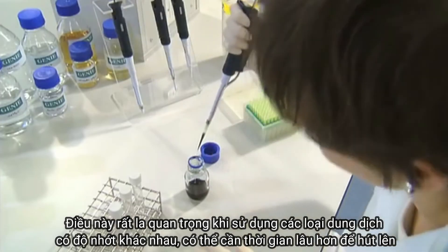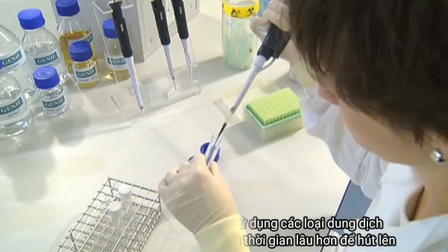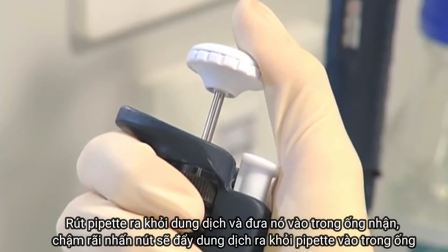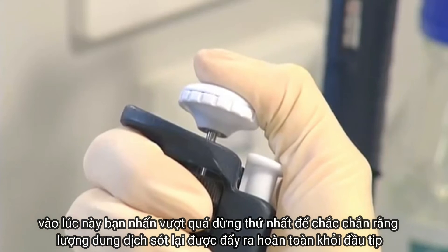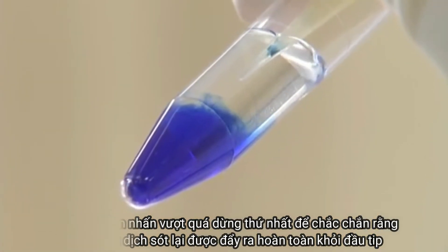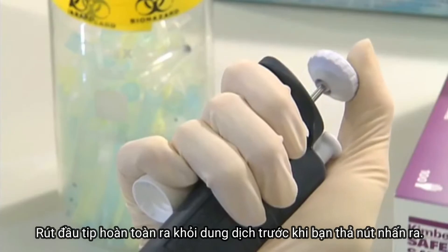Withdraw the pipette tip from the liquid and place it inside the recipient container. Slowly push down on the push button — this will release the liquid from the pipette tip into the tube. This time push beyond the first stop; this ensures that any residual liquid is expelled from the pipette tip. Fully withdraw the pipette tip from the liquid before you release the push button.